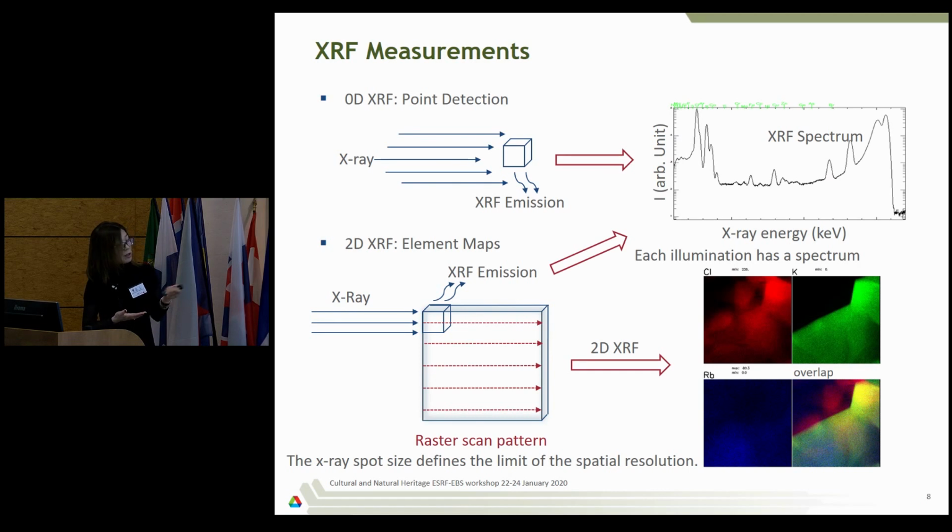Here's the detection logistics. If the X-ray is fixed onto one point in a big sample, or if the X-ray is larger than the sample, it's considered point detection. And this is the detector readout. It gives a full spectrum. By analyzing these peak positions in terms of energy and their integrated intensity, we're able to tell the element species and the concentration in this detection volume.